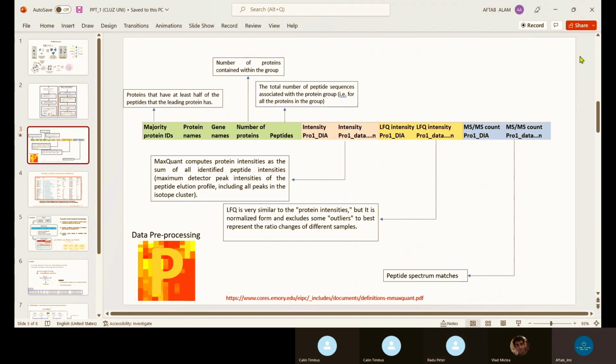Okay. So I'm sharing Perseus. If you also download it, I can share the raw file. You can also try and join. Yeah, that's what I wanted to ask you. Can you share the data file, because we already installed it? Okay, please.